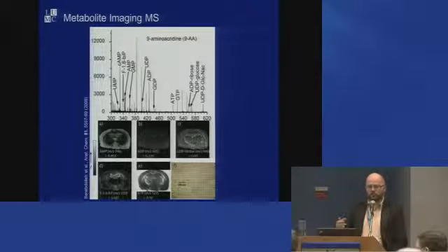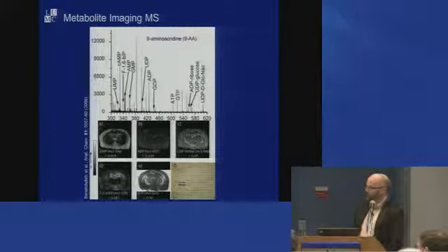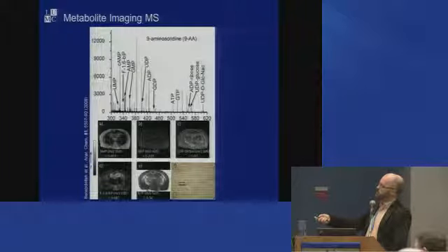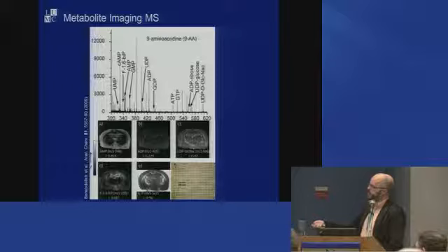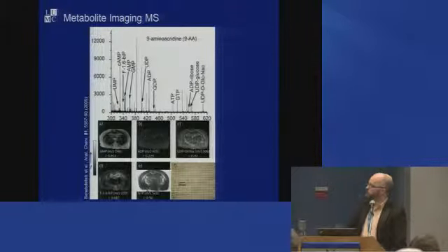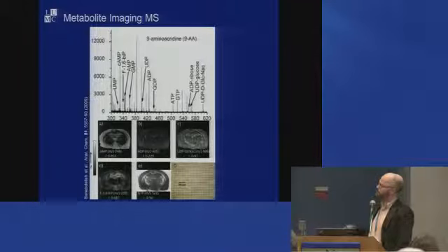Like many people, they looked in the literature and saw people had analyzed metabolites using a certain matrix. So a PhD student said, why don't you try this? And it worked. Here's a mouse brain, they coated it with 9-aminoacridine, and they could see a very large number of energy-rich metabolites and record their distributions. This has been taken up by a number of different groups, particularly some of the groups in Japan, and I'll explain why in a minute.